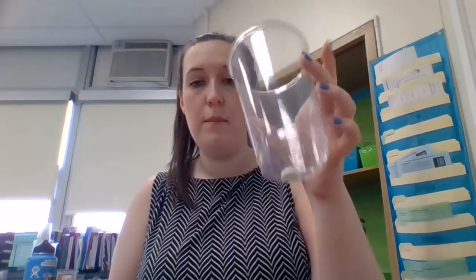Okay. So now you have 1 cup that has a whole tablet in it and 1 cup that has a crushed tablet in it with little pieces. It says pour the water from one of the cups into the cup with the whole tablet. So I'm pouring the water into here. Time how long it takes for it to fully dissolve, where you can no longer see any solid pieces. Record the time in your data table.